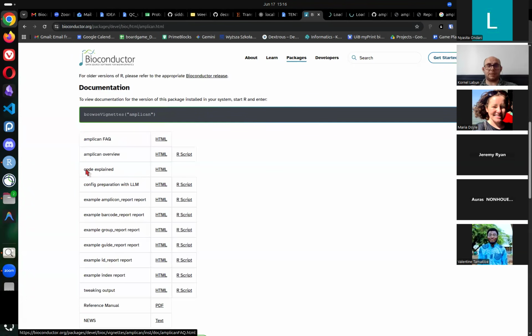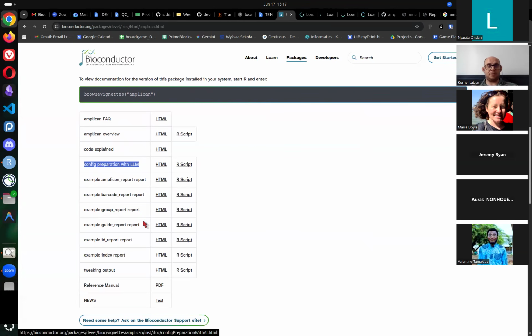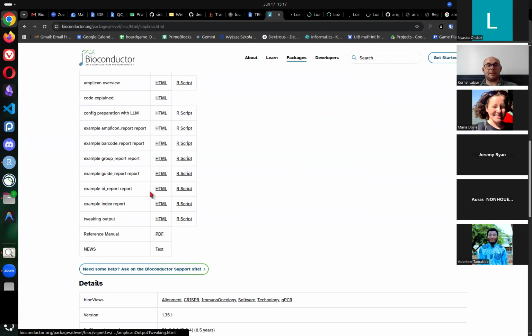We've got the frequently asked questions. We've got the latest ones that I have added. They are not yet available on the normal Bioconductor, the main one. This is only on devel. So I have added one resource, which is code explained, and then how to prepare config with the use of large language models, because this is a very convenient way of preparing the config. And then we have one on how to tweak the output of ampliCan.